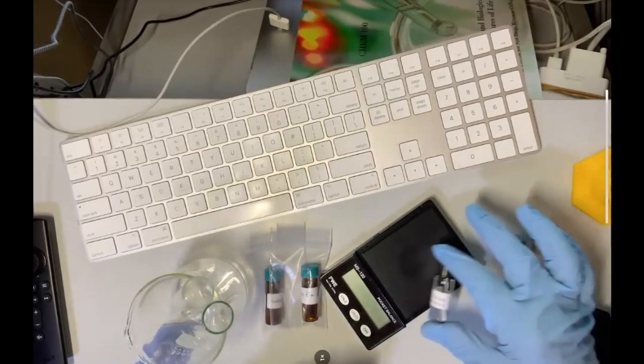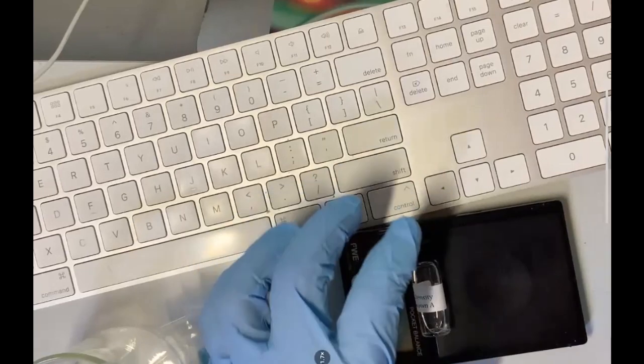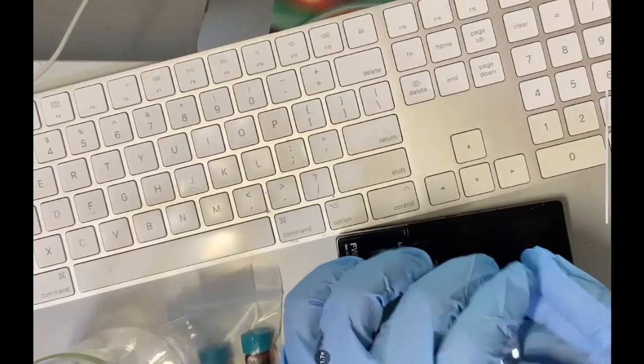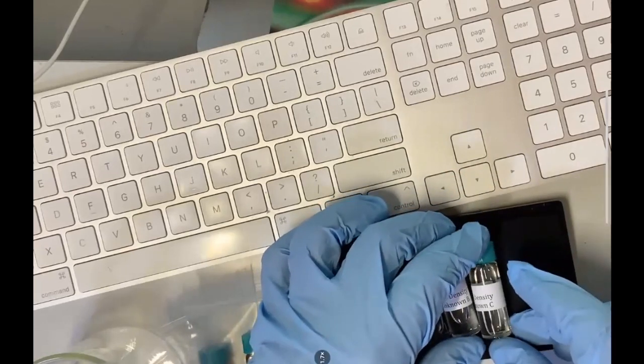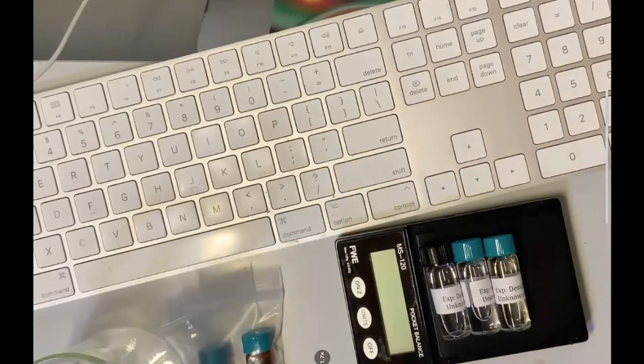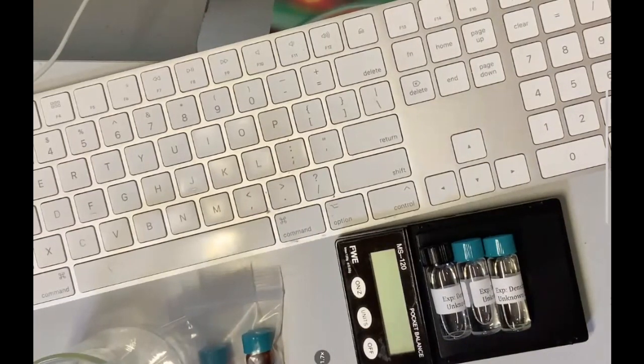Then make sure that you look for density unknown A, that's the first liquid, density unknown B, that's your second liquid, and density unknown C, that's your third liquid. You can certainly use a stirring rod, rubber policeman, and a Beral pipette if you need it. And make sure that you clean your graduated cylinder between runs.